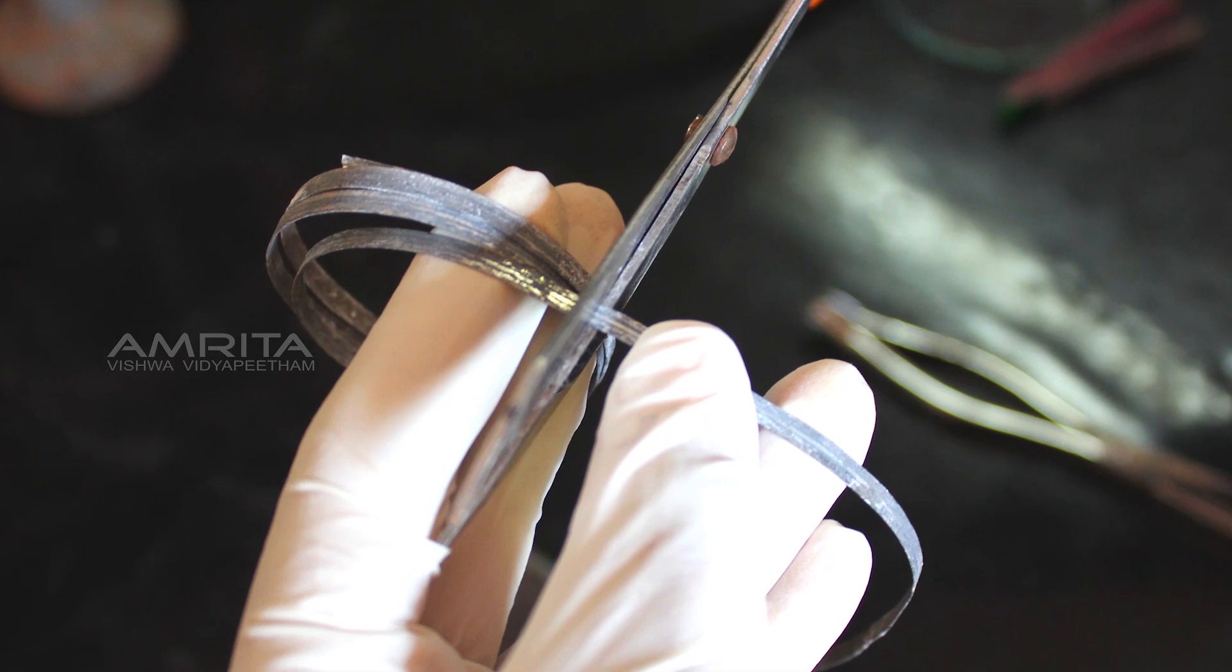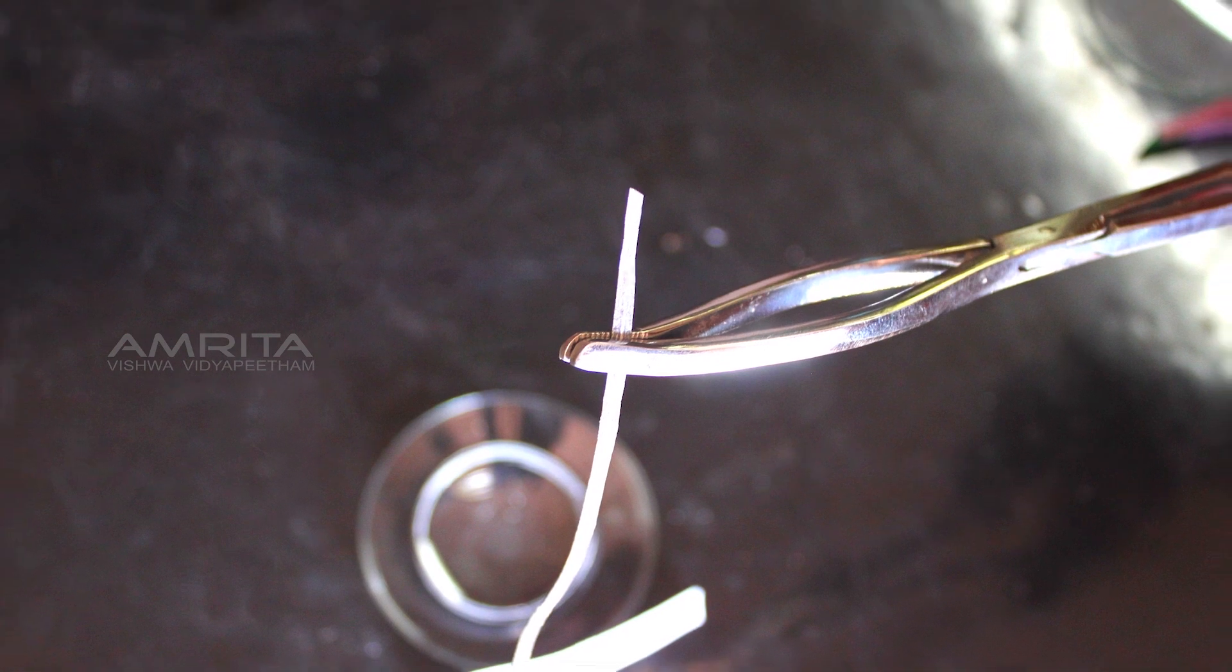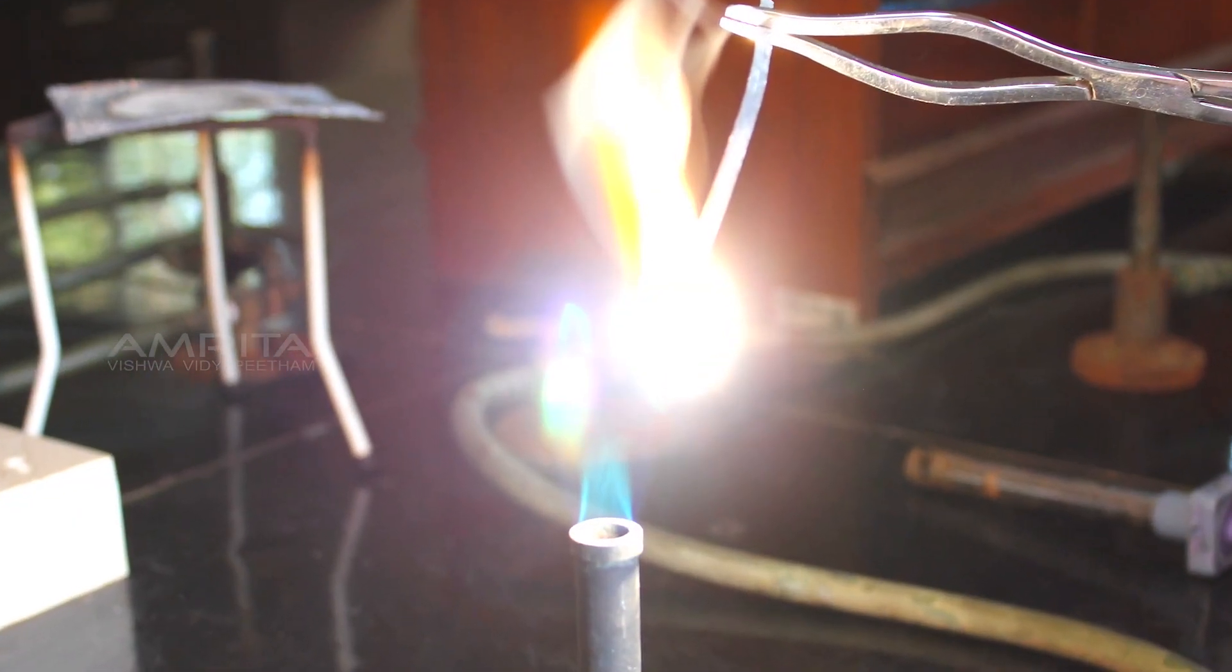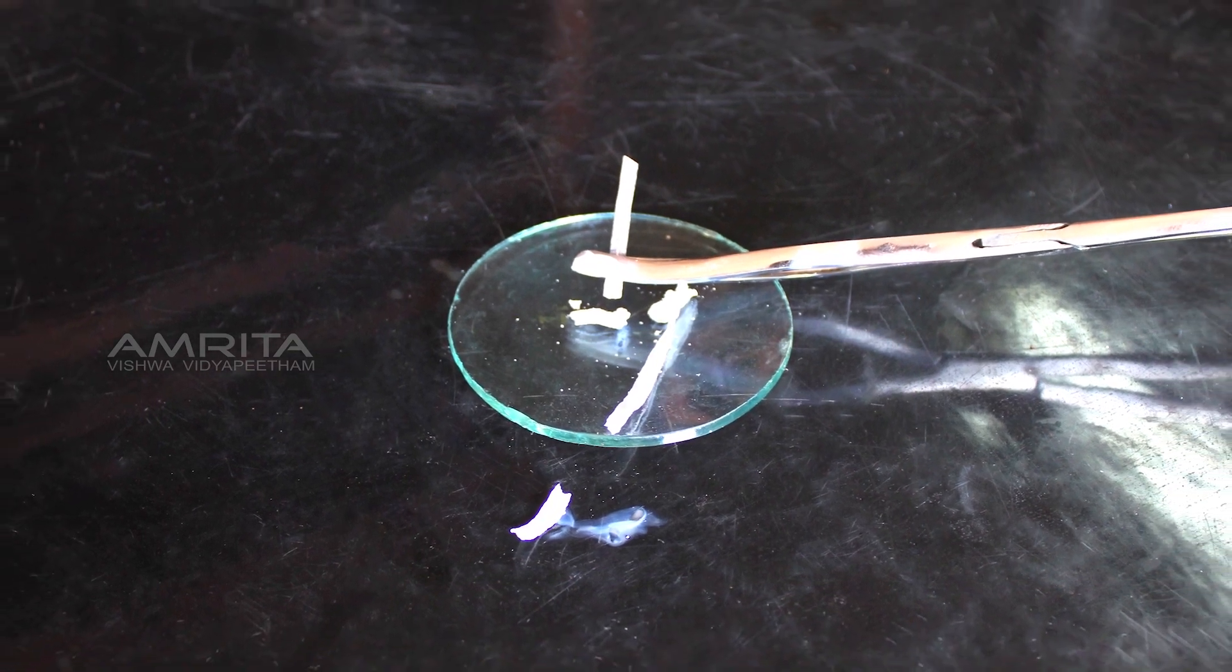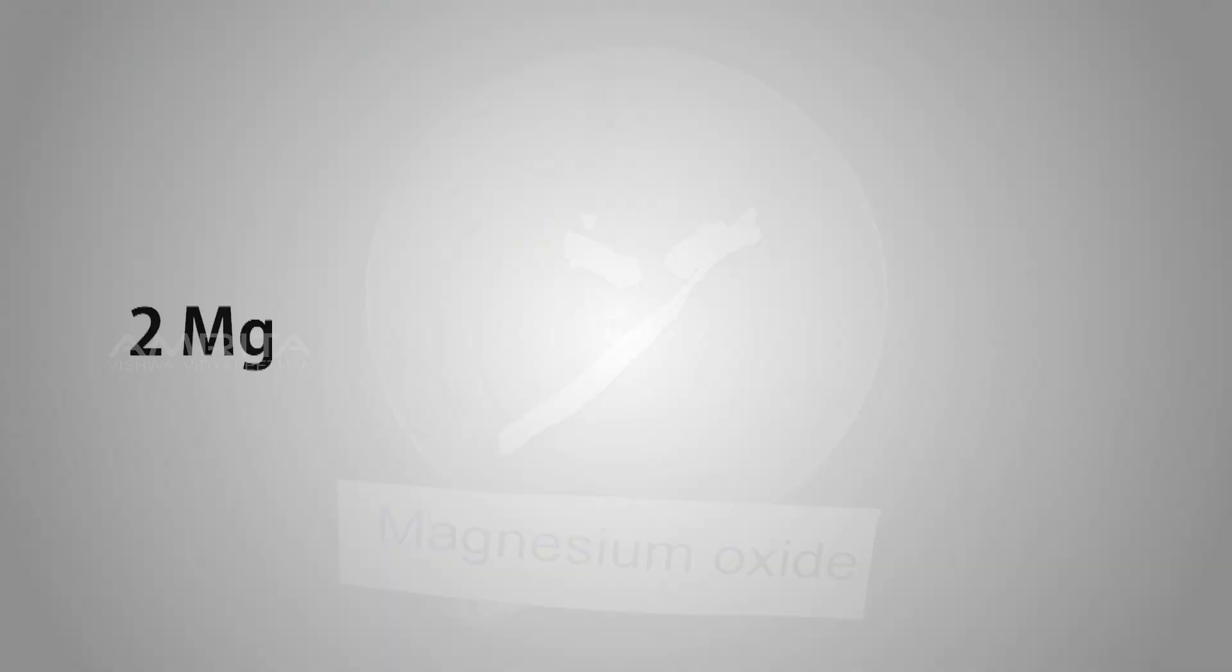Cut a piece of magnesium ribbon and hold it using a pair of tongs. Flame this ribbon in the Bunsen burner. Collect the burnt ash in a watch glass and label it as magnesium oxide. This is a chemical reaction as oxygen and magnesium come together to form magnesium oxide.